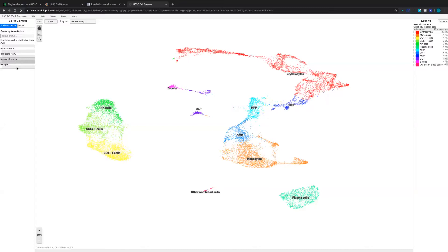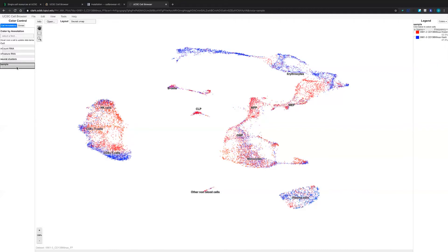In this dataset, we have an extra metadata which is sample. We can color these cells based on different samples. We have two samples included in this dataset — one is colored red and one is colored blue. Based on this color code, we can directly check the difference among different clusters between these two samples.